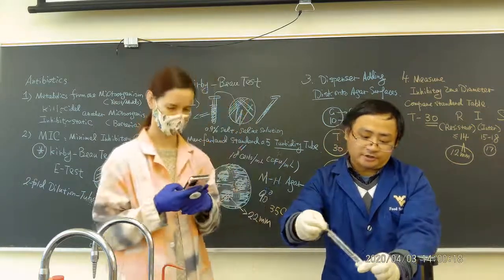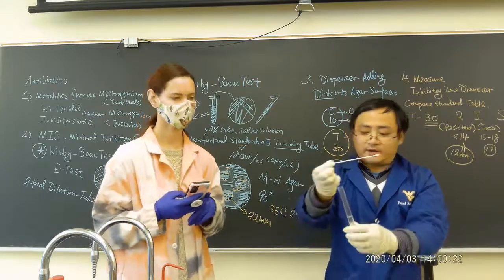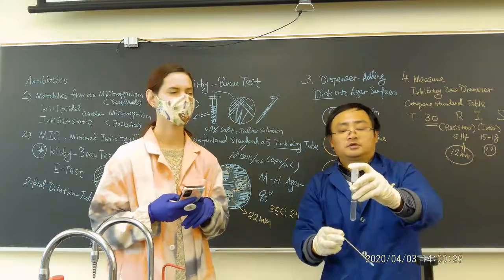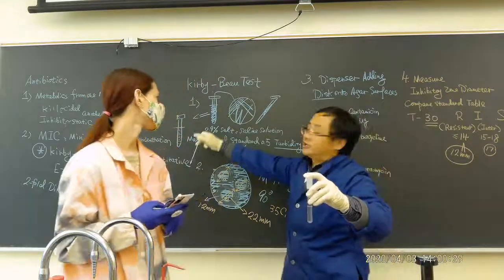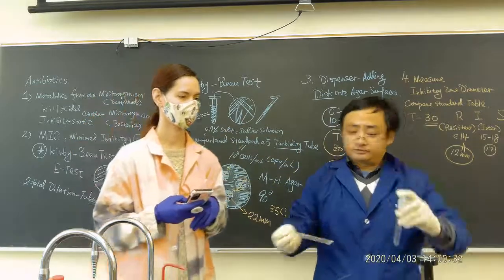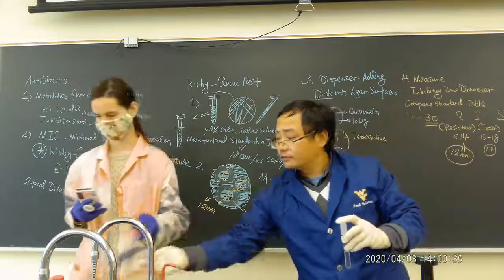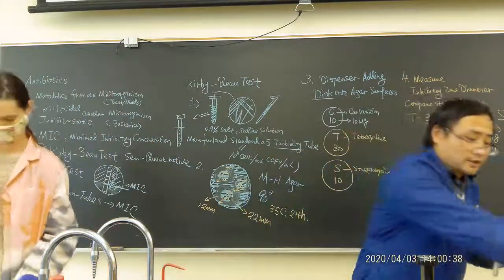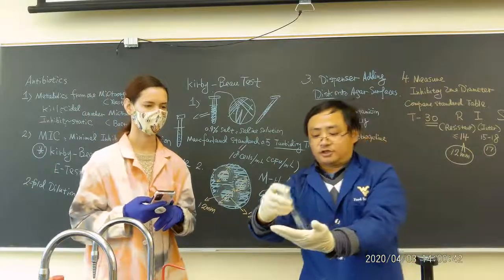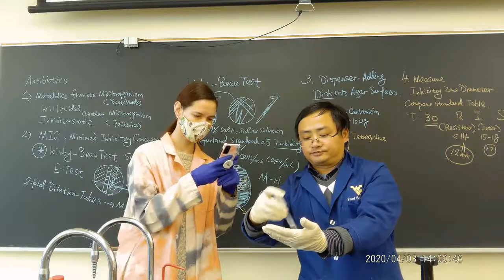I don't know how dense it is, but ideally the amount you put should follow the McFarland standard, which means I should compare with a standard. I don't have it right now. Okay, so this one actually should be thrown away. I will just put it on this side. Now I want you guys to make sure it's mixed very well. So we want to make sure you mix it.